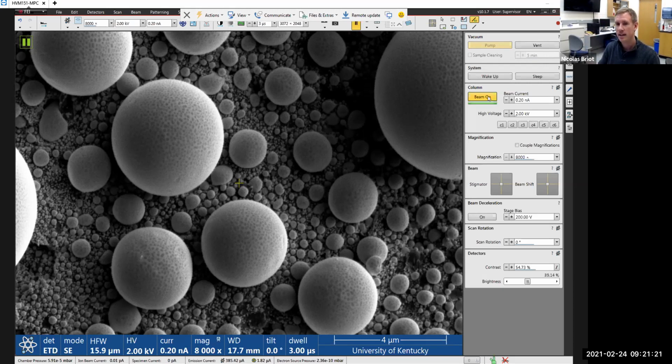Okay, and that voltage that is giving that pulling force on the electrons to give them energy and momentum, this is what is represented here by that high voltage. So pretty much every commercial SEM can go all the way up to 30,000 volts, or 30 kilovolts, 30 kV. You can see I have presets from 1 to 30.